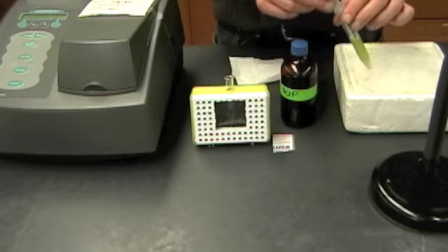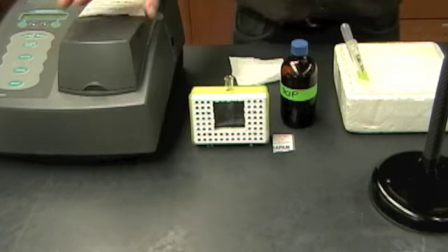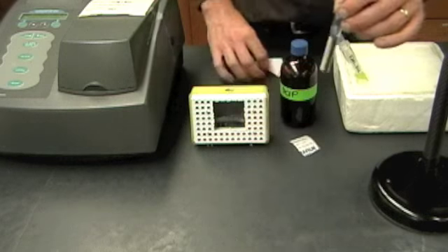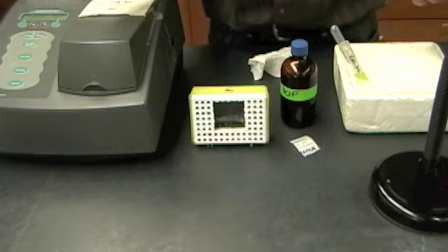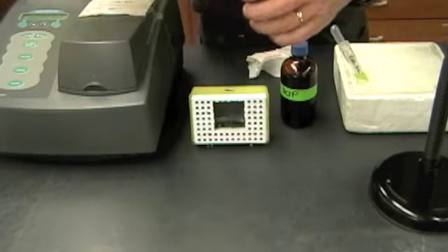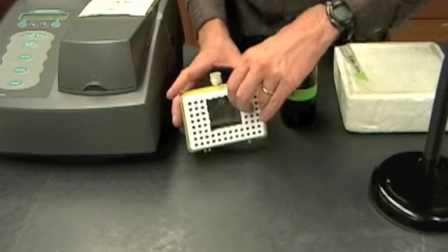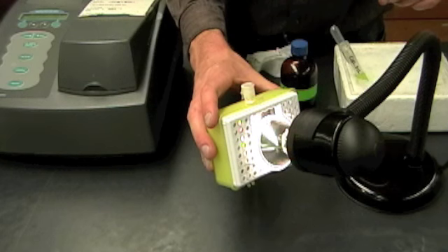The last thing I've got is my chloroplast dilution ready to go. So now that everything's set, I can take my blank out. I'm going to add 1/2 ml of my chloroplast dilution to this. Quickly, I'm going to wipe this off and get my initial spectrophotometer reading. Now once that's been done, I'm going to take it off, cover it over, put it in the cassette, and then hold it right up against the light. And now I'm going to wait for 1 minute.